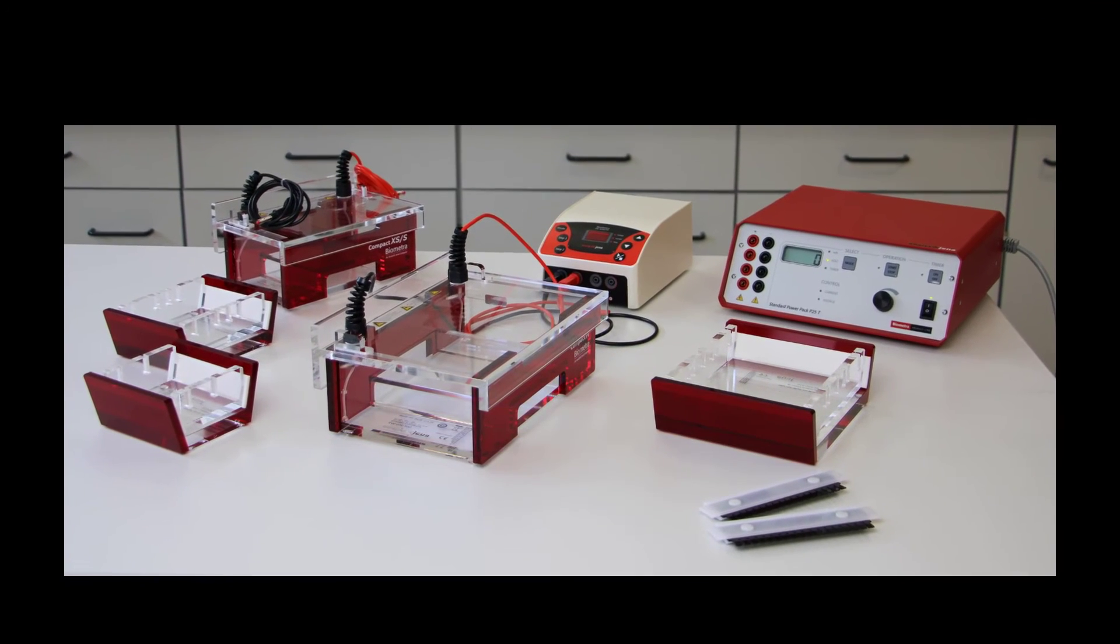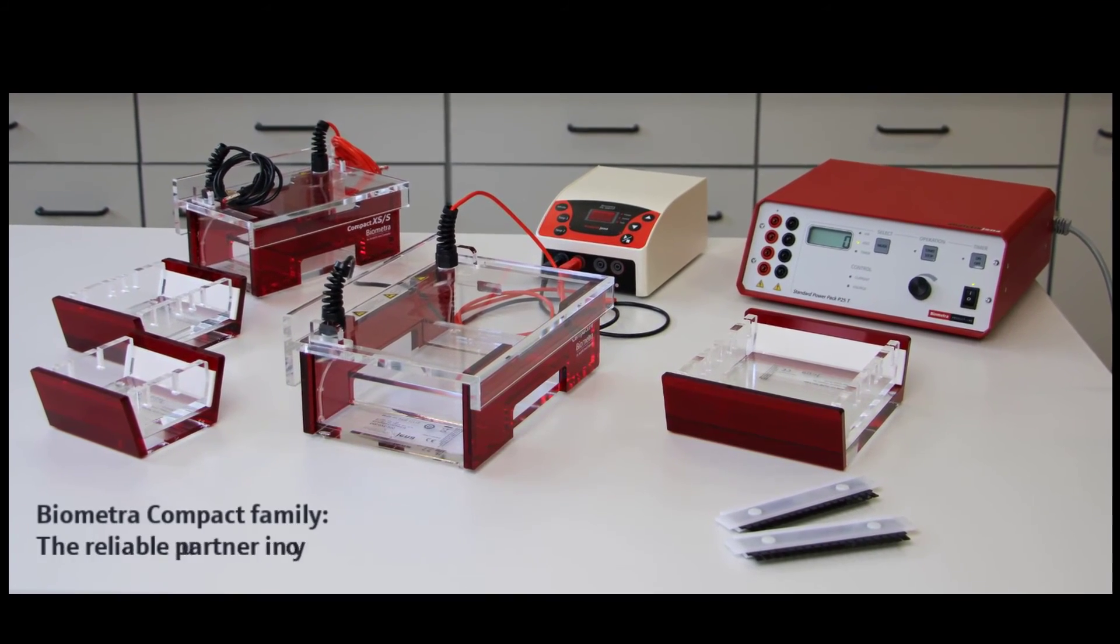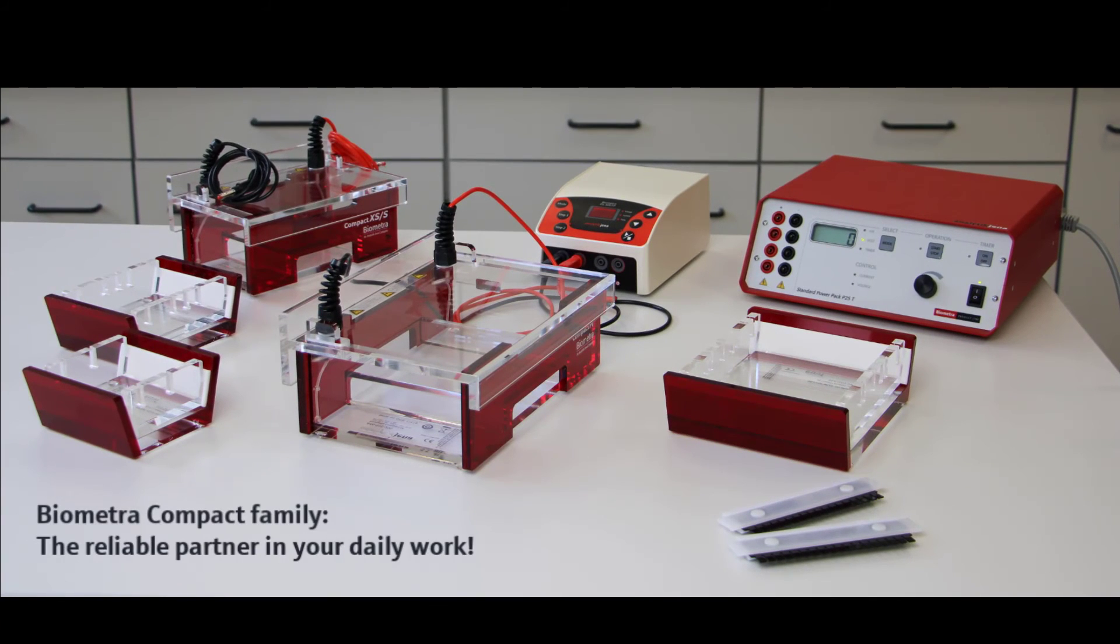With the Biometra Compact family, you have electrophoresis systems at your side that make your work pleasant and safe thanks to well-thought-out details.